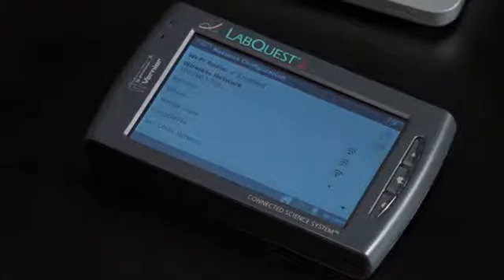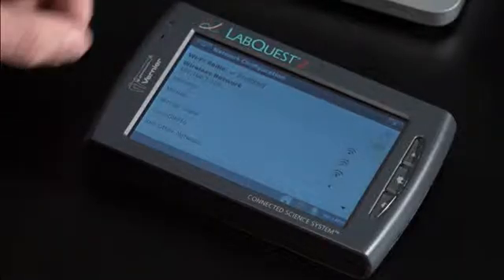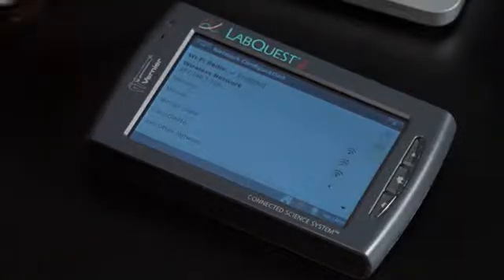And we'll know when we've connected to the network when we see an IP address, which is a series of numbers. You don't have to worry too much about what those numbers are. Just when you finally see those numbers, you will know that you are actually connected to the network. And there we are. Wireless network, 192.168.1.126. So now that my LabQuest2 is on the same wireless network that all of these devices are on, I can view the LabQuest screen or transfer data to a computer, to an iPad, tablet, or a phone.